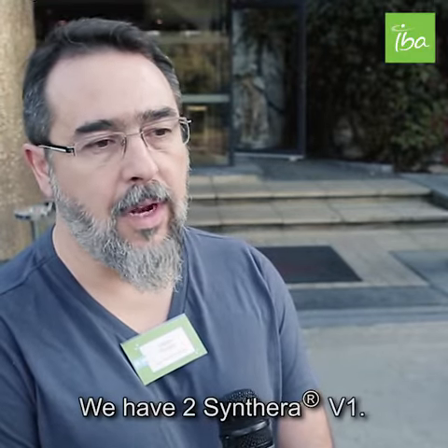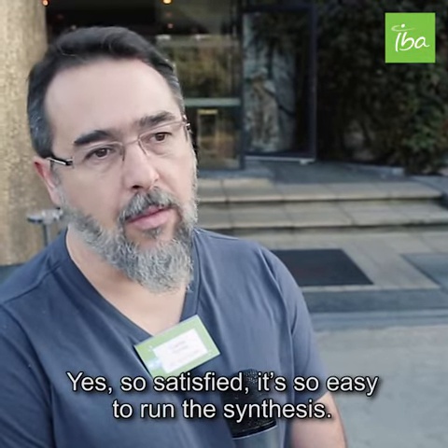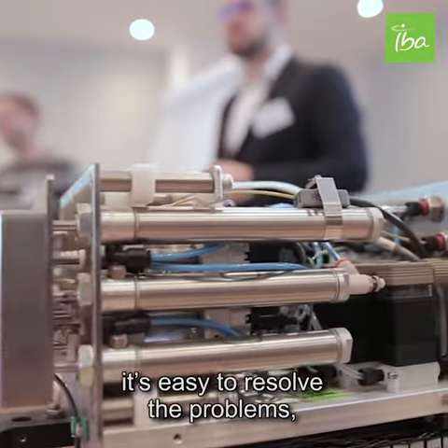We have two Synthera V1, yes, so satisfied. It's so easy to run the synthesis, it's easy to resolve the problems.